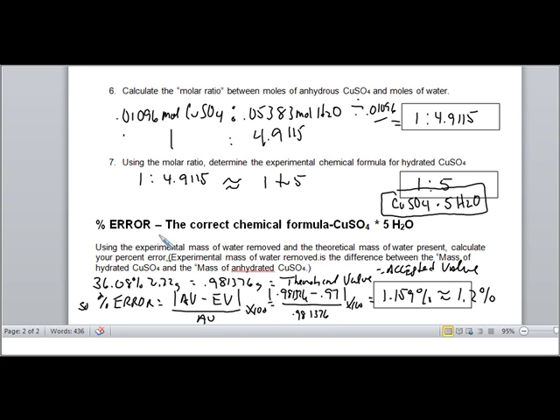So now here on your percent error, what I'm asking you to do is take your masses and compare your masses, okay? You could do it with percentages, but I'm asking you to do it with masses, okay? So you take the 36.08 that we calculated in the very beginning and you multiply that by your sample size. If it was 2, then your correct mass would have been what? 0.7218, right? But my sample data here is 2.72. So the correct mass, if I were perfect on here, would have been 0.9813, whatever, right? Okay. But the mass that I actually measured was 0.97.